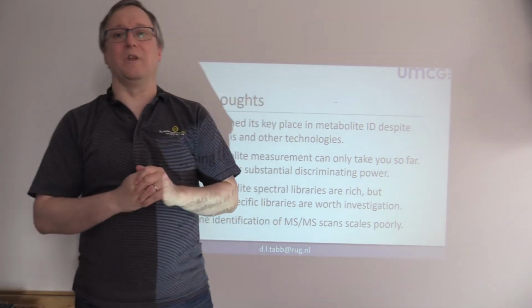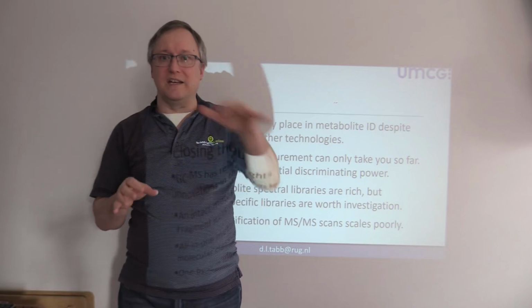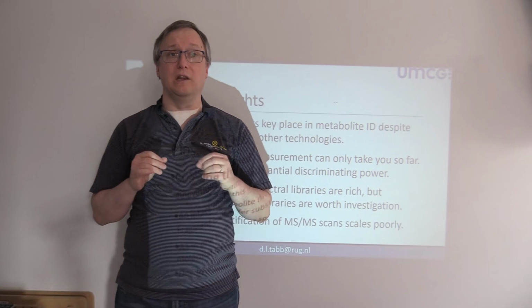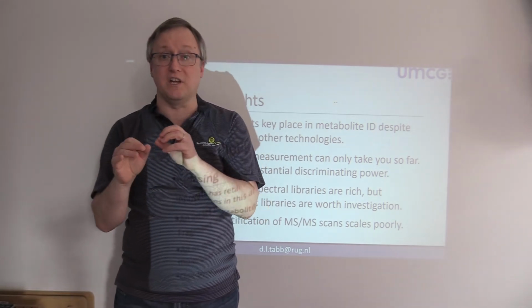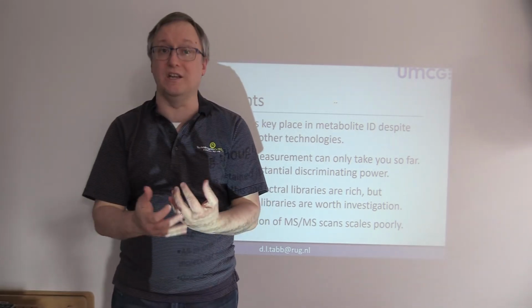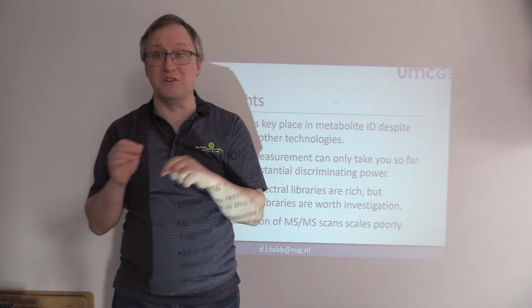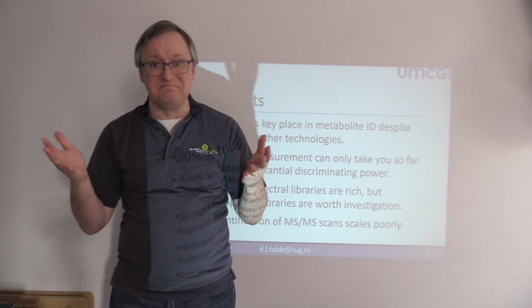Okay? So automating this analysis at a large scale is something that has been relatively slow. Largely this is because of the great diversity in matching quality that occurs for metabolites that generate just 2 or 3 fragments or those that generate dozens.